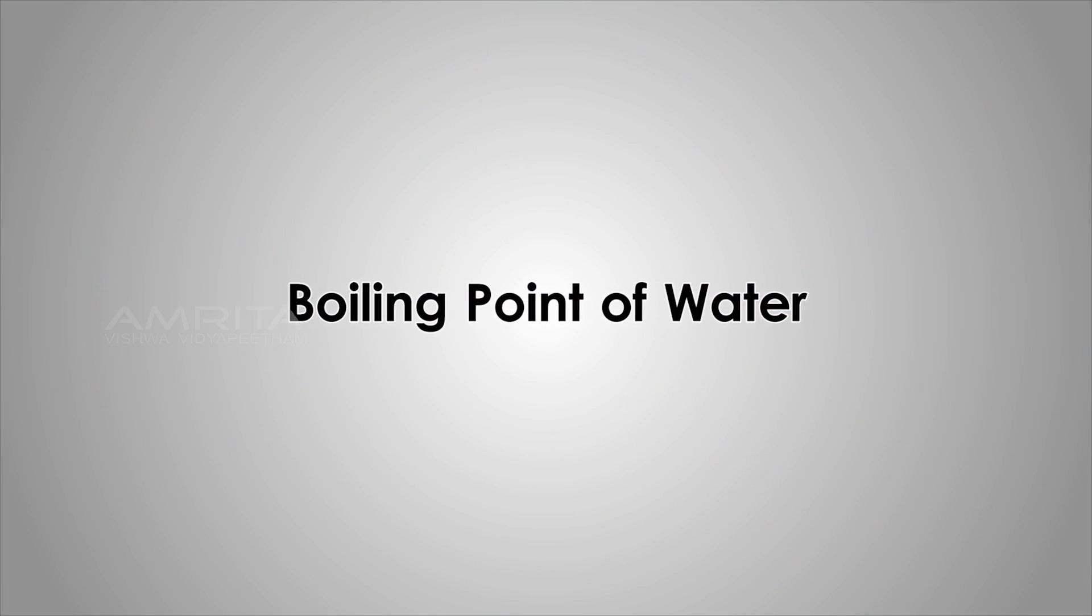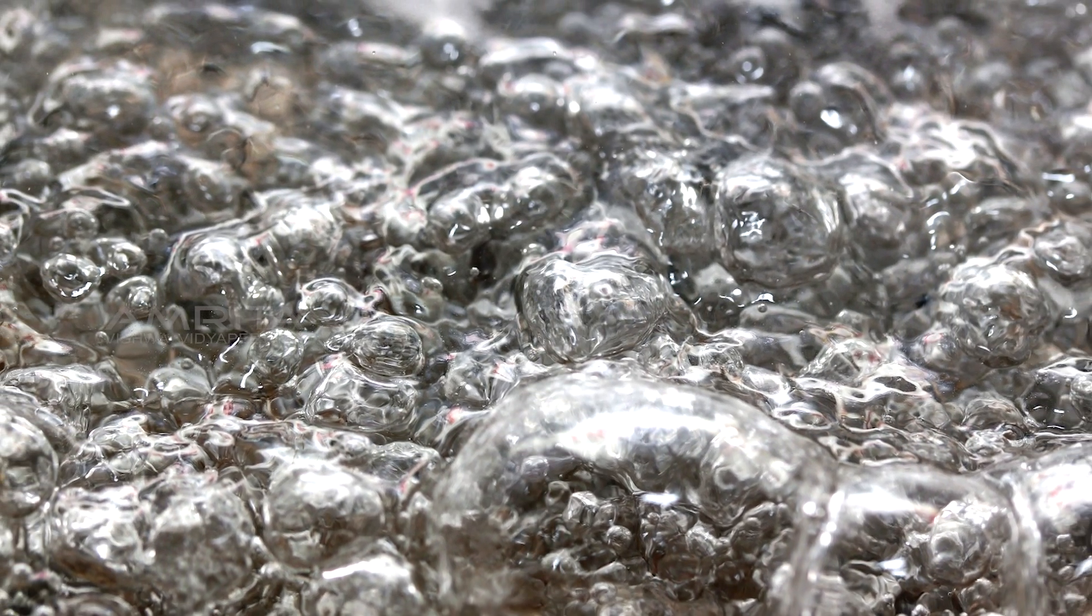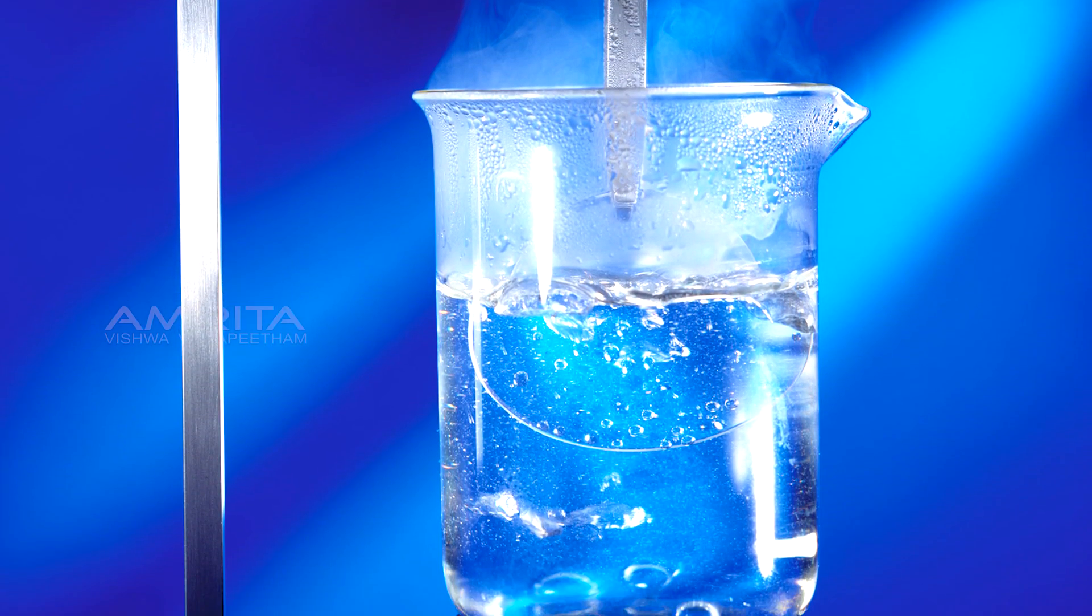Boiling Point of Water. The boiling point of a liquid is defined as the temperature at which the vapour pressure of the liquid equals the atmospheric pressure surrounding the liquid.